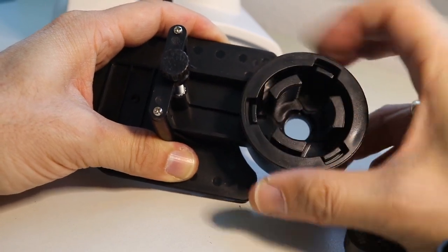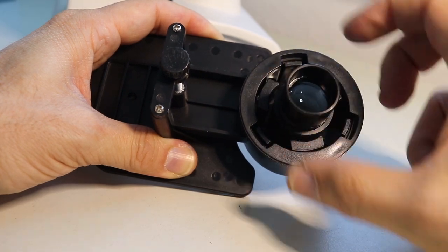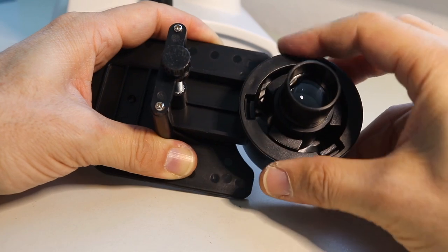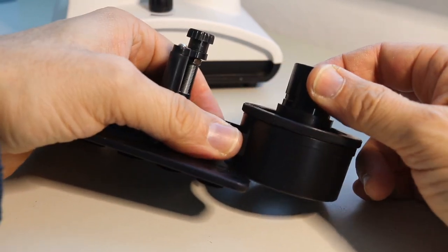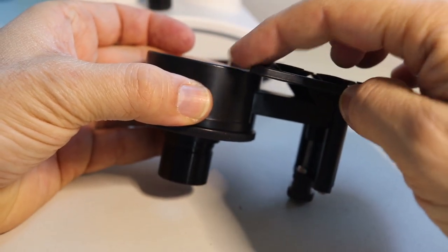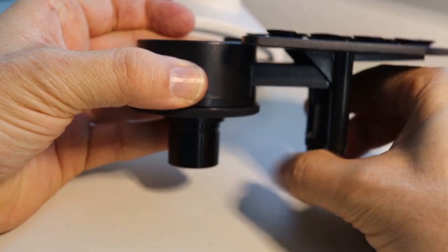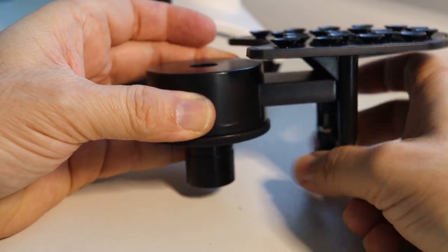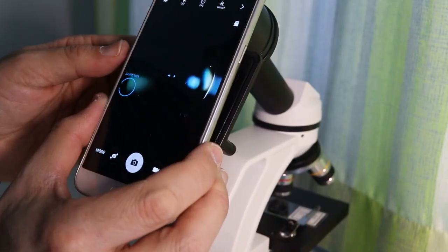And you can see that by screwing and turning the ring, it is possible to clamp in the eyepiece, and this is quite solid. Actually, it has a very good grip on the eyepiece, which is quite important. Now, this is the so-called adjustment of the eye relief, which is the distance between the mobile phone and the eyepiece. And this distance is very critical. This is actually the thing that gave me a little bit of a problem, because the distance is too large. And I'm going to show you right now.